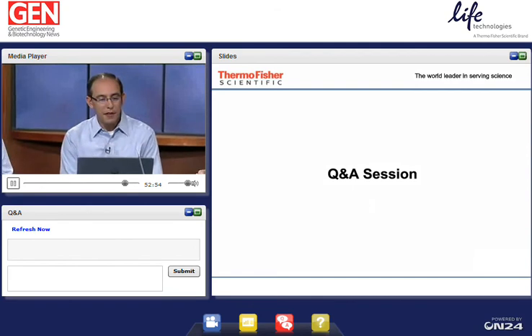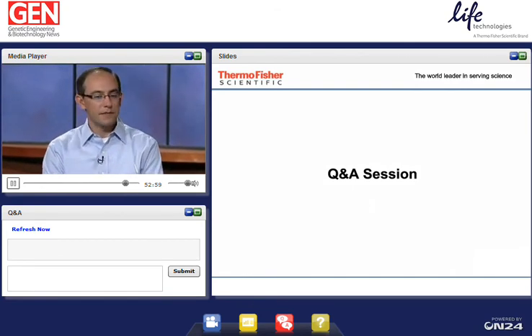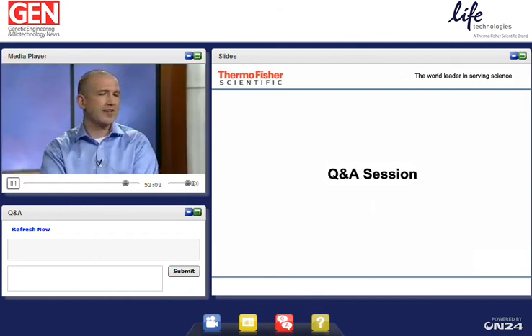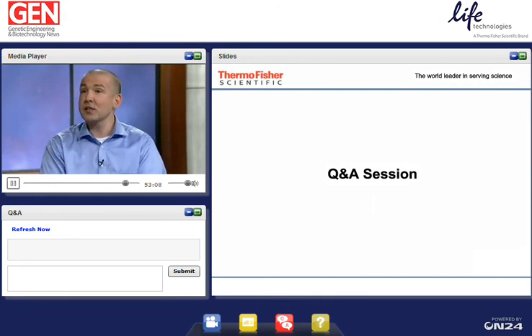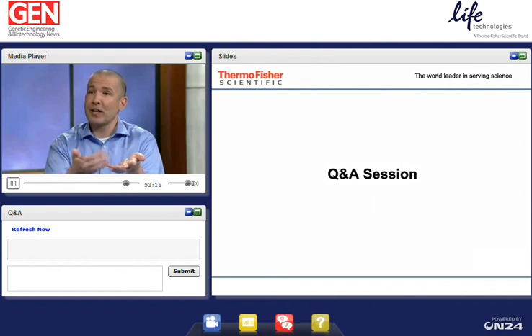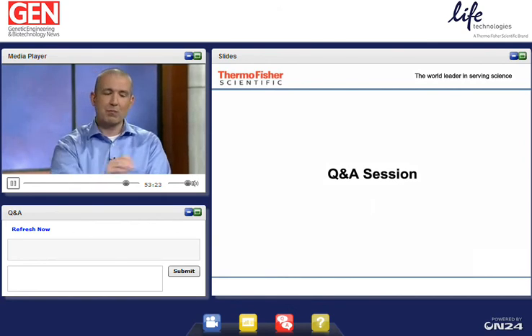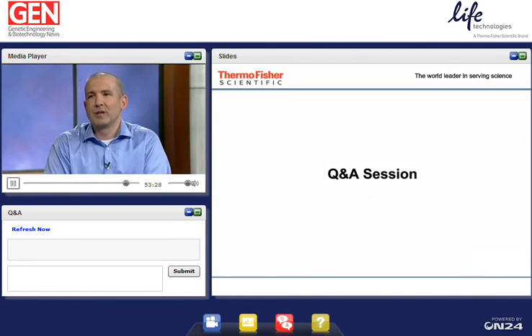Can you start your iBind by the end of the day and then take it into the next day, into the morning? Absolutely. Yeah. I mean, you can run it overnight. It's going to run 3 hours. So if you start it at, let's say, 8 o'clock, it's going to run 8, 9, 9, 10, 10, 11. It'll be done by 11. It's going to sit there from 11 until the next morning. But the point is that the membrane stays moist. The card is still moist. And then the next morning, Thomas, you were talking about how you can come in, and especially if you're using fluorescence detection, you just come into the lab, put that membrane on the imager, and boom, you're done. Yeah, 5 minutes is usually what it takes me.